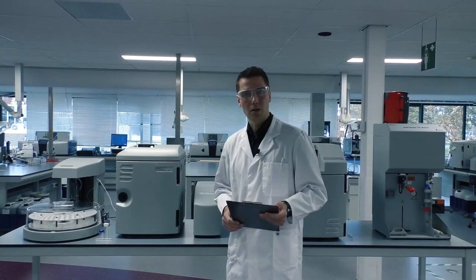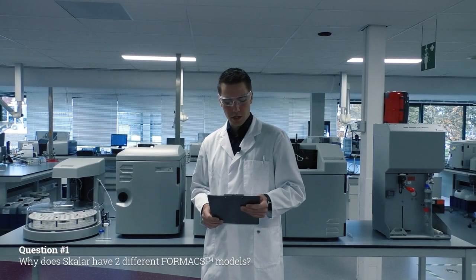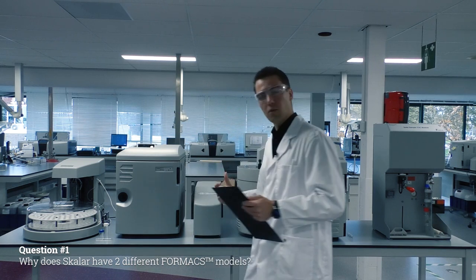We're standing here in our laboratory for our 5th series of our frequently asked questions. Today we'll be handling our FORMACS series. So let's head up to the instruments. Okay, let's start. Question number 1. Why does Skalar have two different FORMACS models?